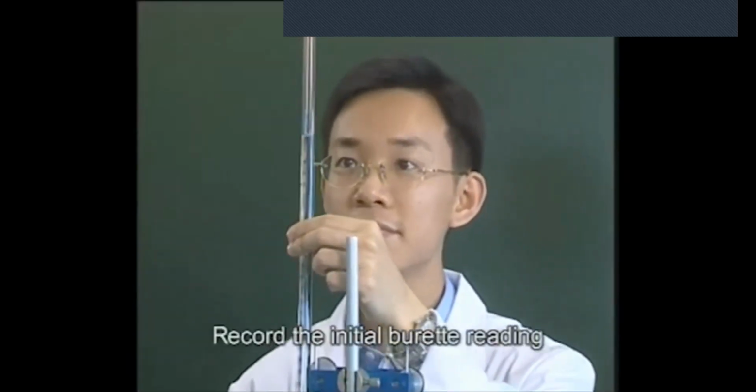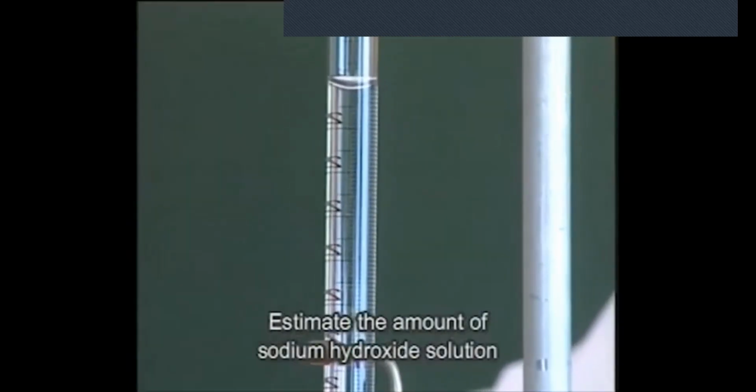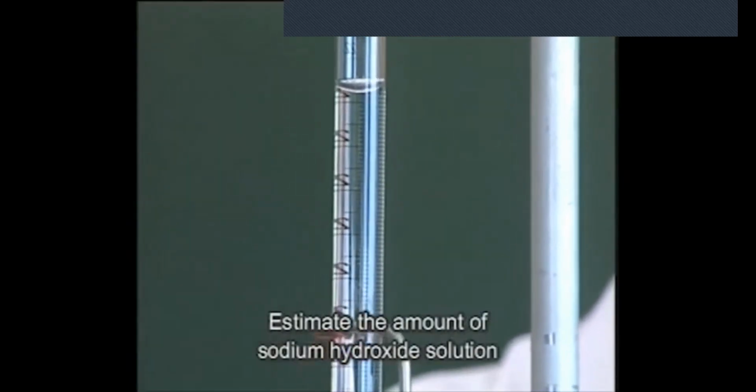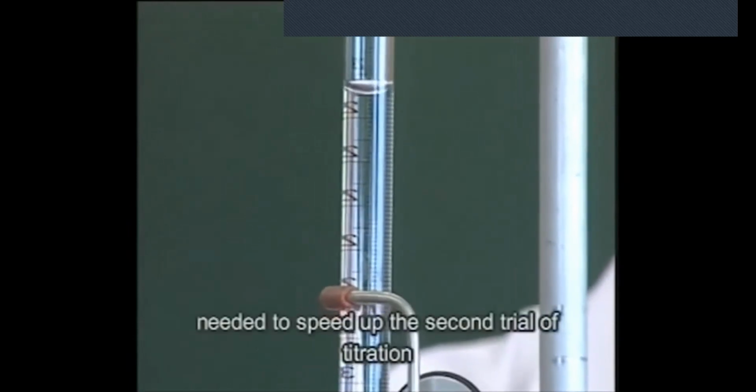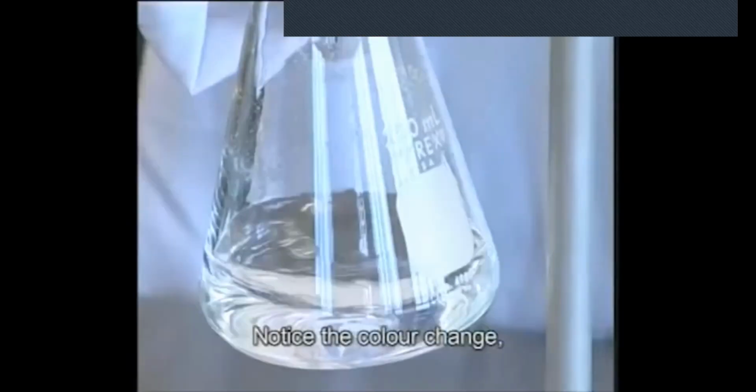Record the initial burette reading. Estimate the amount of sodium hydroxide solution needed to speed up the second trial of titration. Notice the colour change.